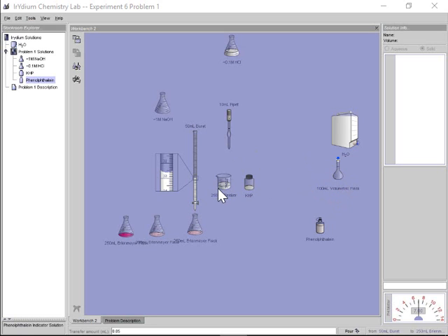One other advantage of doing it this way is when we pull out our pipette, we generally don't want to pipette out of the volumetric flask, because that narrow neck may make it a little bit more precarious. But now that it's in a beaker, we can very simply leave the pipette underneath the solution. You soak up, in this case, 10 milliliters. It acts like a straw. We transferred it in. I did this 3 times, so we can do 3 trials.